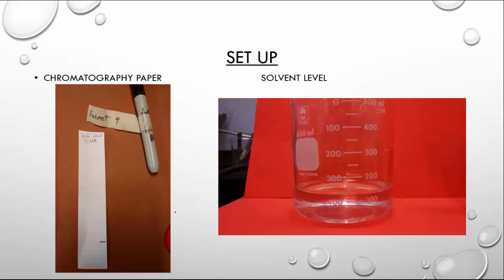You're going to take the chromatography paper and label it in pencil. Make sure you label first a mark of where you want to put the ink, and then the info of what type of pen you're using. So in this case, maybe 'Suspect 4' would go up here, and then down below, approximately about one inch above the bottom, is where you're going to put a mark — that's where the ink you're going to test will start.